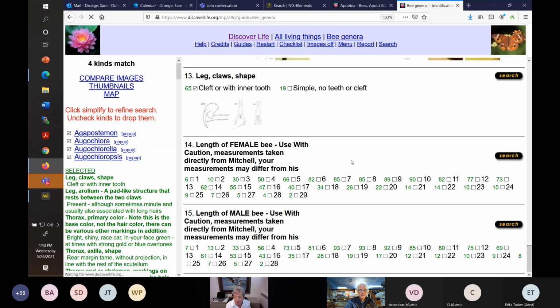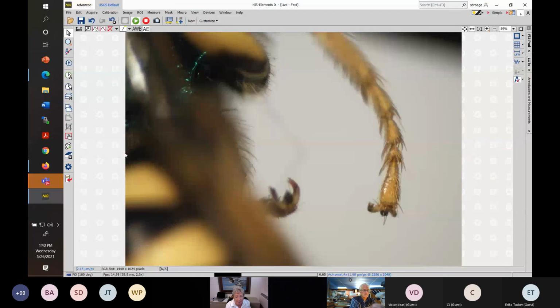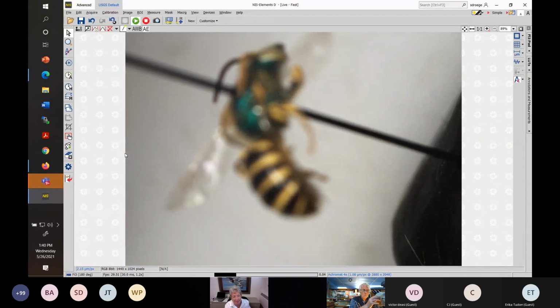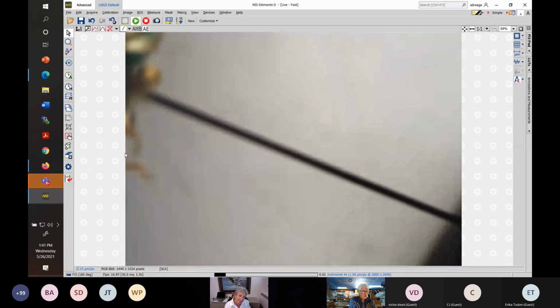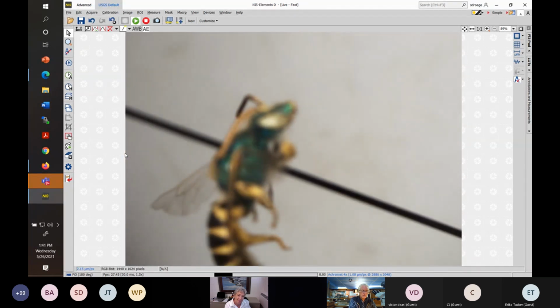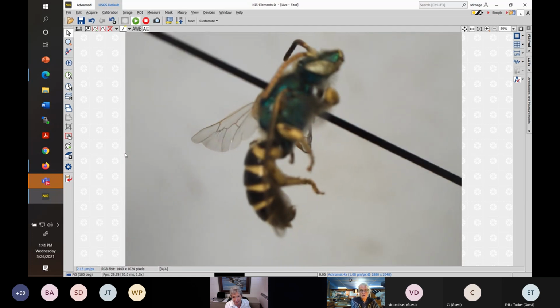Okay, we're going to bring back into existence these three, and let's flip back to the microscope and talk about how you would measure that bee. So one problem is that while some microscopes have measuring tools, and a digital one like this would have a measuring tool, and you could just measure it there, a lot of microscopes don't.